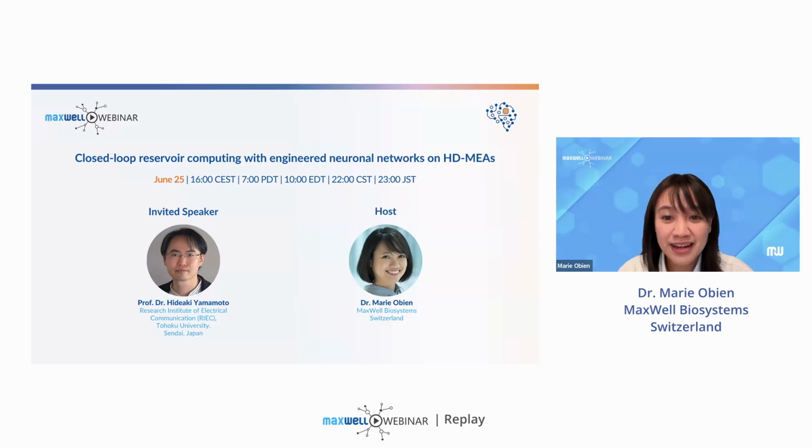Thank you. The next question is from Michael. How durable are the connections between the HD-MEA surface and the neurons, and how well do they adhere?